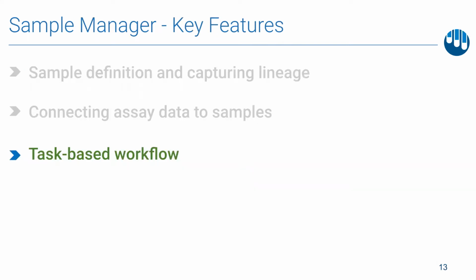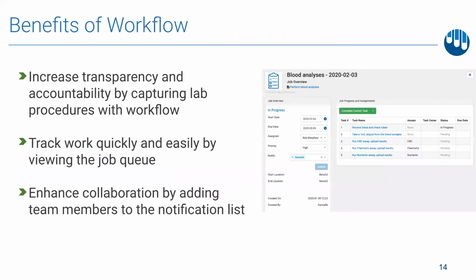Creating an application that was going to help scientists do their work was really important to our team, which is why we decided to create a task-based workflow tool. This tool allows managers and scientists to capture their lab procedures transparently, track their work quickly using job queues, and enhances collaboration through our notification and comment features.